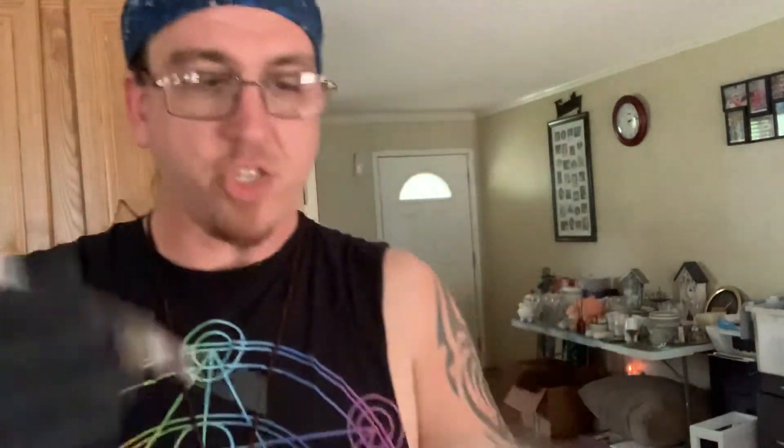Wipe again — you want to wipe the top, the needle, whatever comes in contact with your jar and your spores. You want to make sure you're all good.